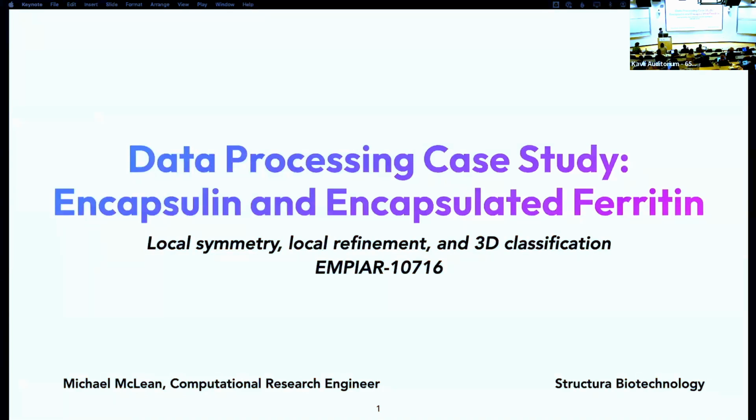Okay, so I work on the development of some of the algorithms used in CryoSPARC for 3D reconstruction. I originally joined the team back in 2020 as an undergrad intern. And back then I worked on some of these tweaks to the standard workflow that Rich presented, tweaks to help CryoSPARC work a bit better for proteins with helical symmetry, actually. And since that project, I've worked on various other topics in 3D reconstruction, focusing a bit on geometry and symmetry.